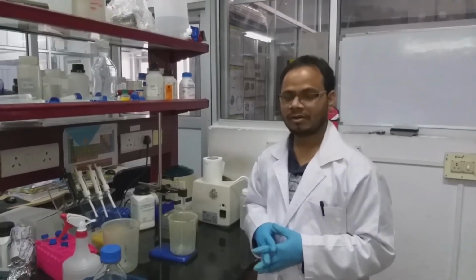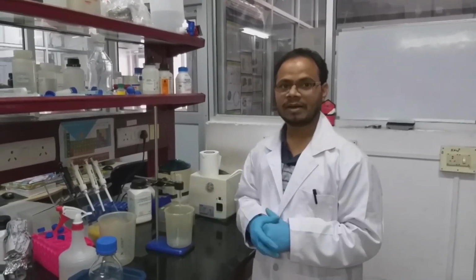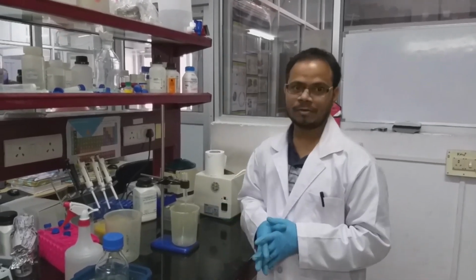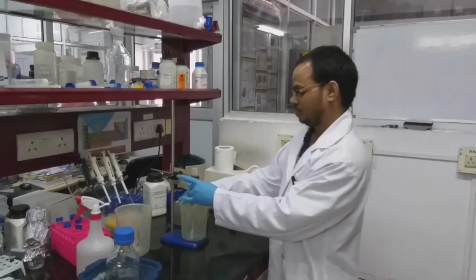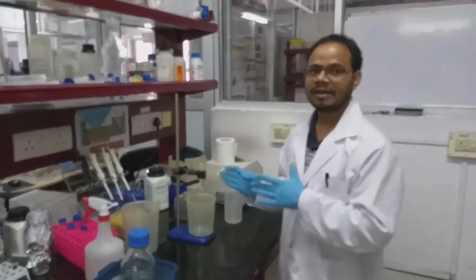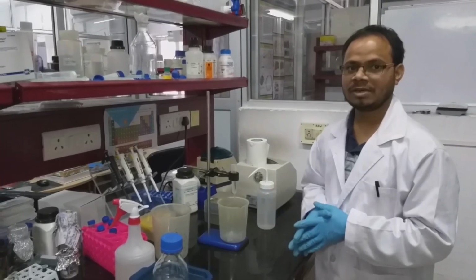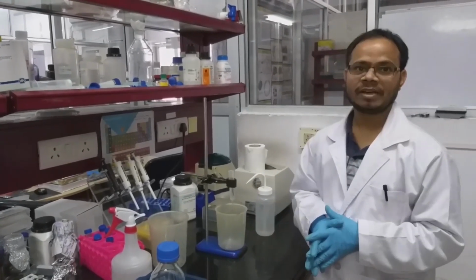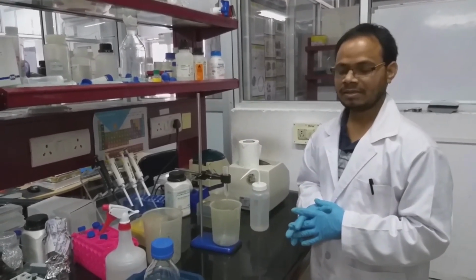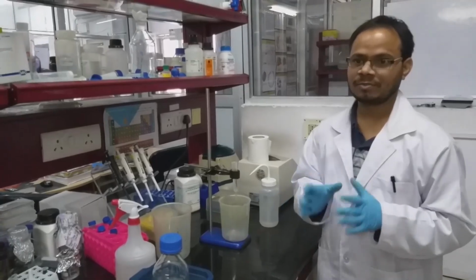While the centrifugation is going on, we have to wash the column. This is in 20% ethanol. So we have to wash first with water, then equilibration buffer. Let it drain completely, that 20% ethanol. Then we will add water, double distilled water. At least 5 column volumes of water should be added to remove it completely. And next we will equilibrate with the lysis buffer, the buffer which we used for the lysis of the bacterial cells.